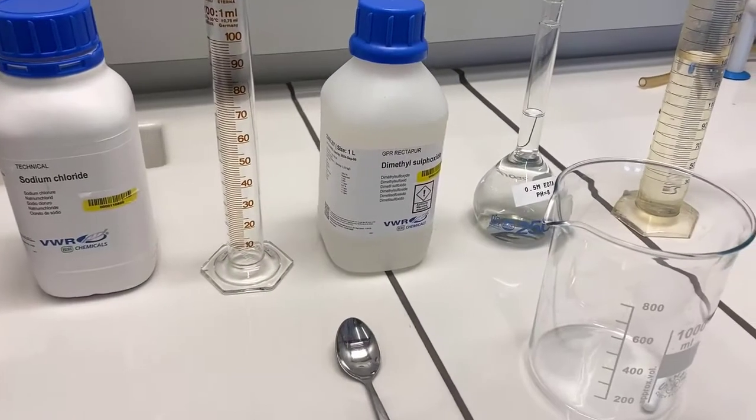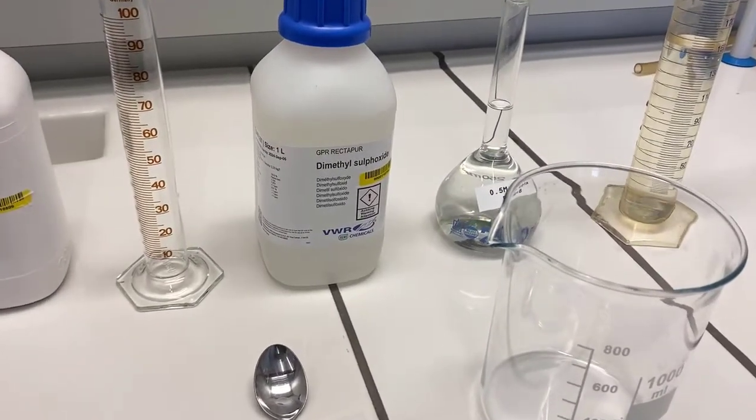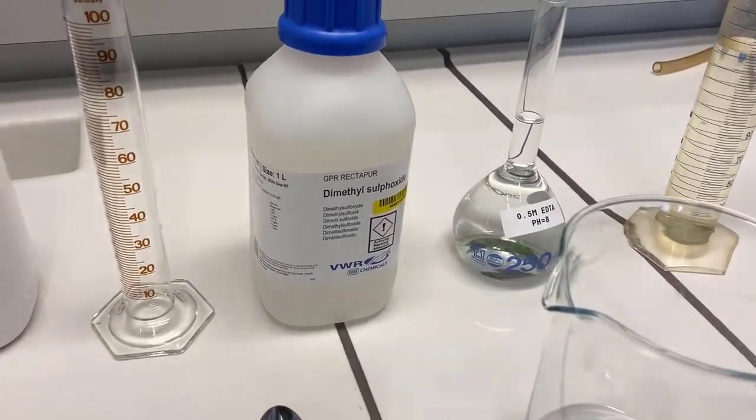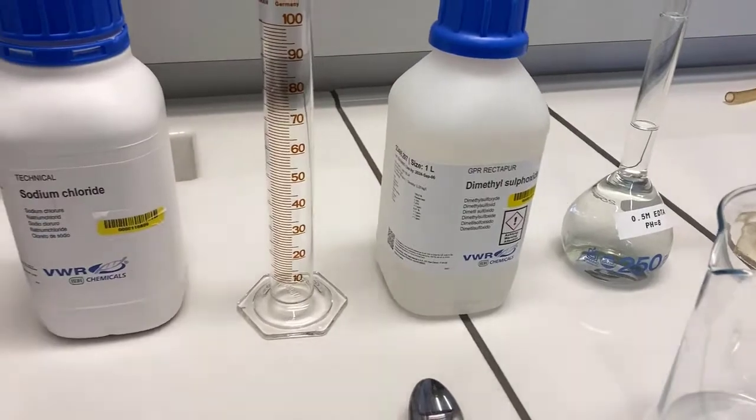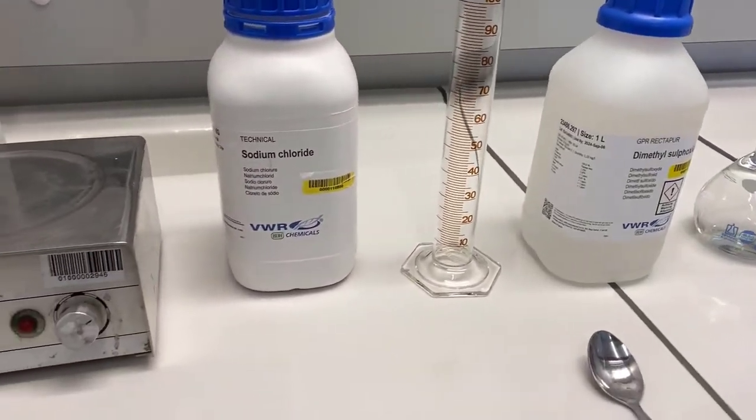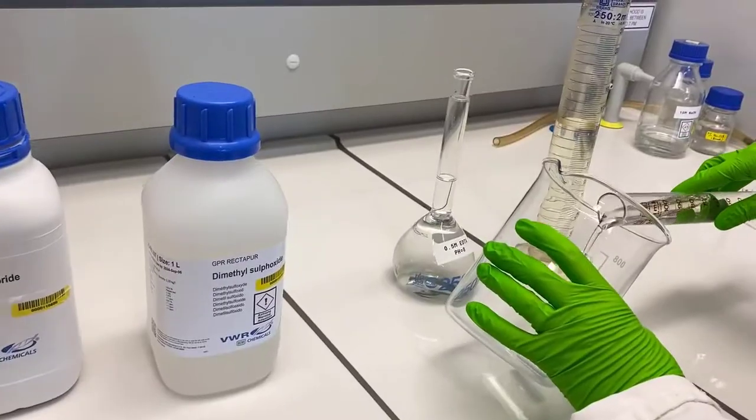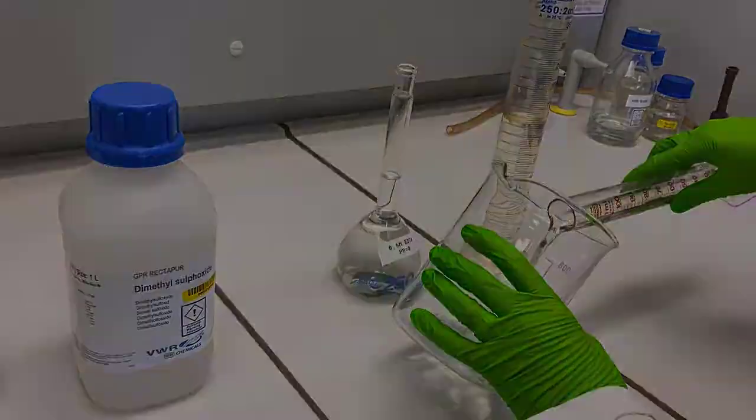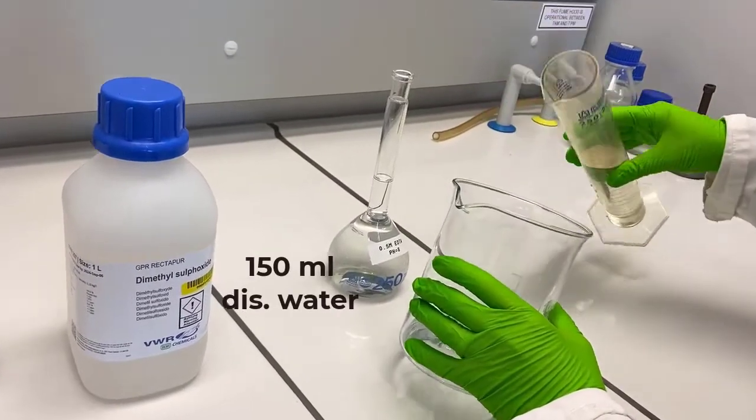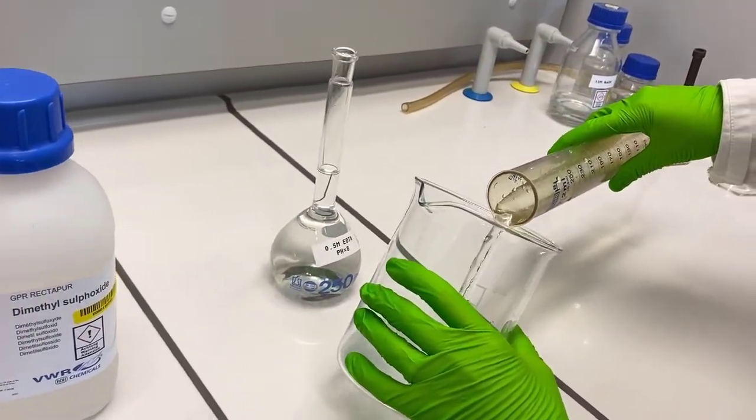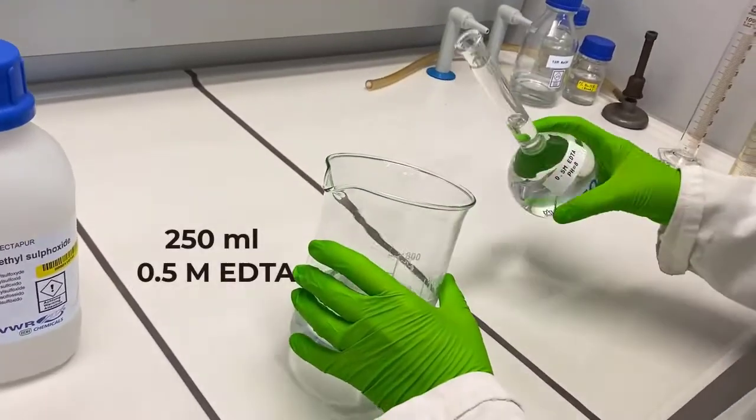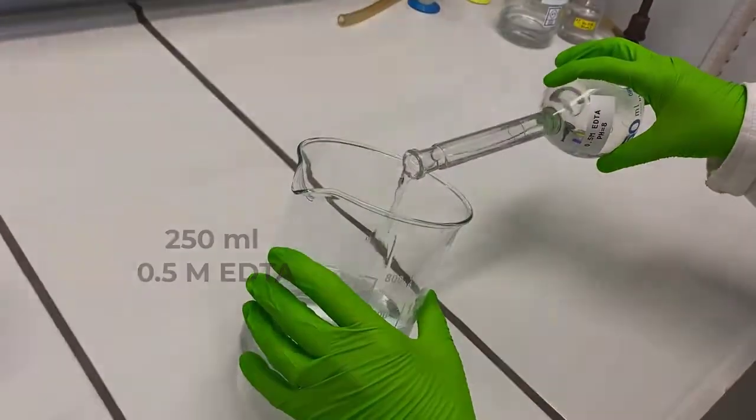The next step is a simple mixing of our 250 ml of 0.5 molar EDTA with 100 ml of dimethyl sulfoxide liquid or DMSO and 150 ml of distilled water. This will finally result in 500 ml of salt solution containing 0.25 molar EDTA and 20% DMSO at pH 8.